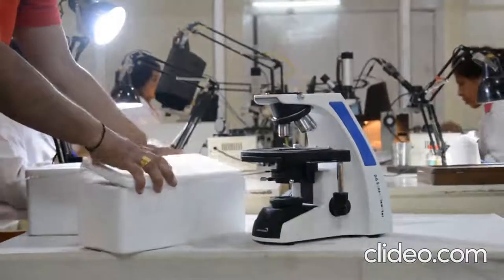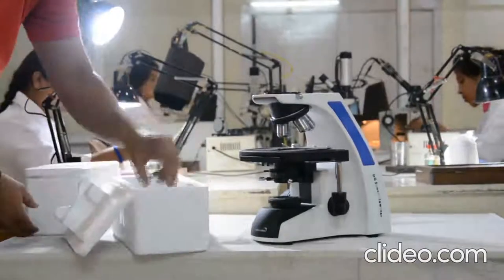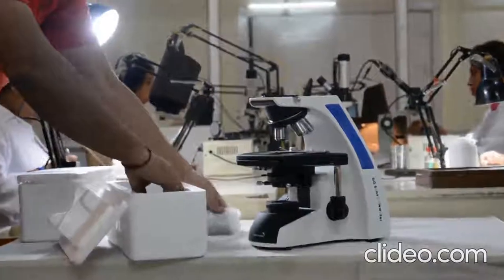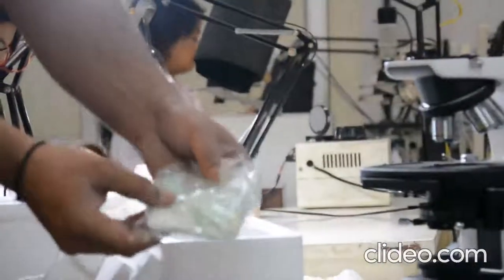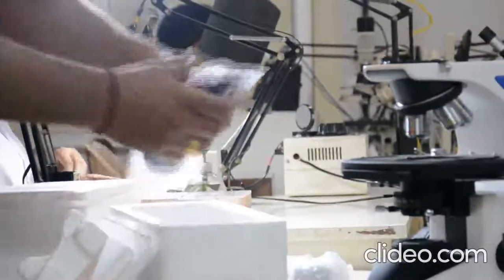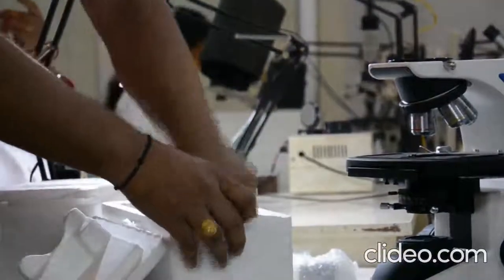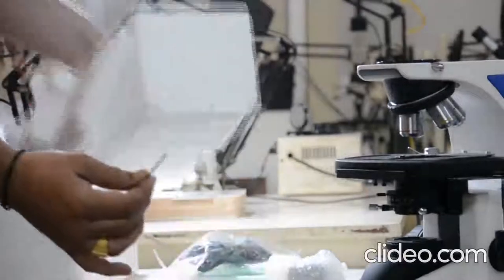These are the other attachments which come along with the microscope. These are the eyepieces. This is the dust cover. And this is the power cord. And this is the Allen key which will be used later.